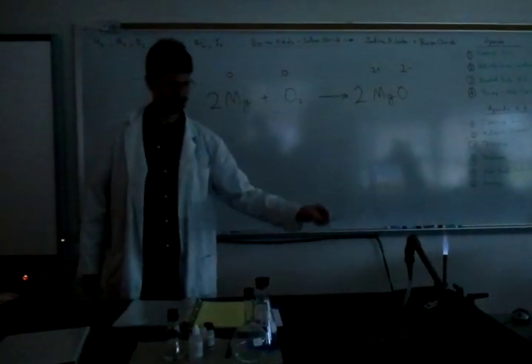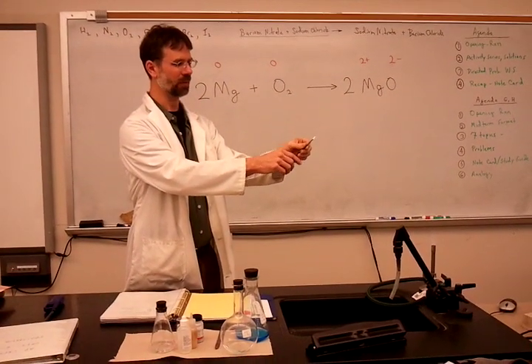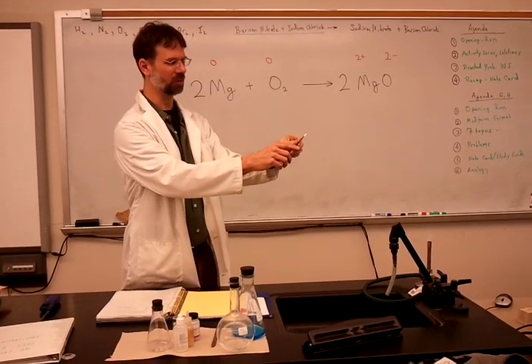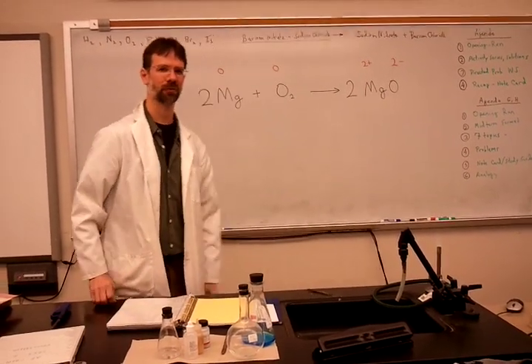Okay, lights. And you can see what happened to the magnesium, which was a nice shiny piece of metal, is now just a crumbly ash, which is magnesium oxide.